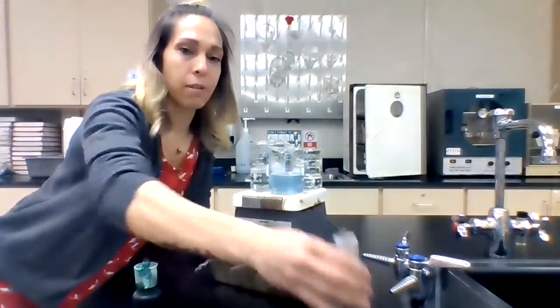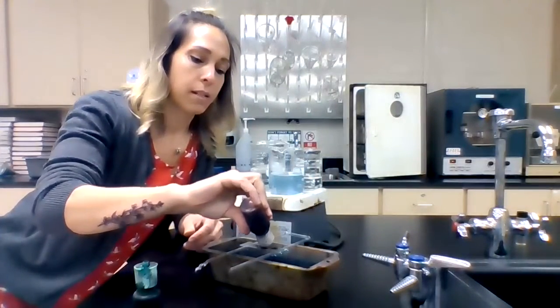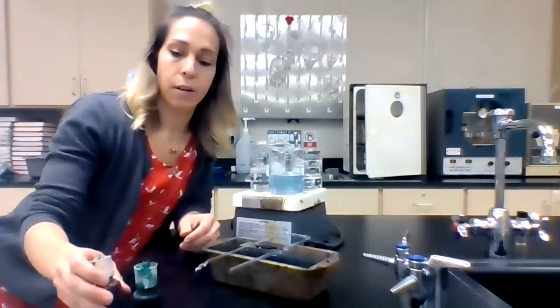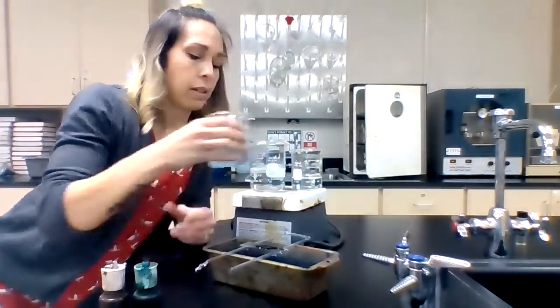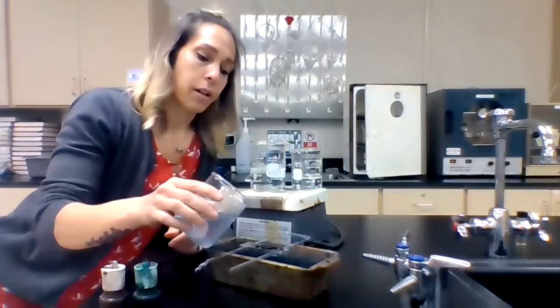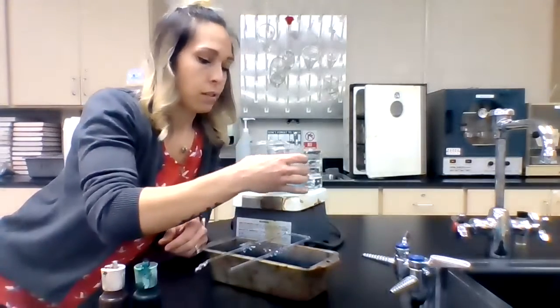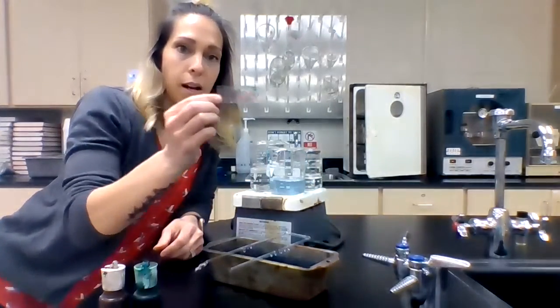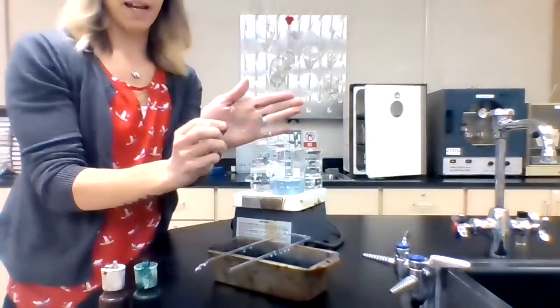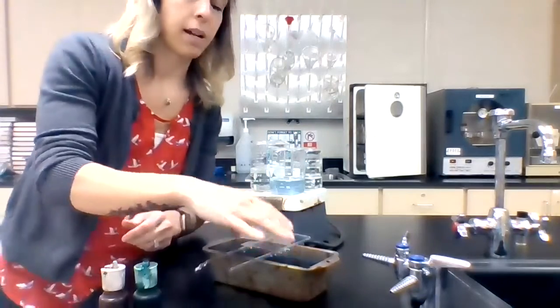And from here, after we rinse it off, we're going to do a counterstain. So we're going to put our pink safranin on here, and we're going to let it sit for our 60 seconds. And then you're going to take your water cup and you're going to rinse it again. So once it's rinsed, this one here, I don't know if you can see with my hand, it's going to probably have a green outside, but be pink kind of in the middle.